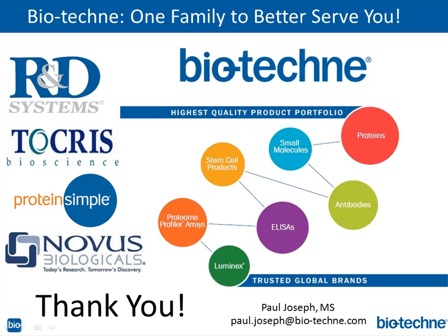Sure. Great. And then Yvonne comments, says, great presentation, and asks if you have any advice for phosphoproteins, and specifically, how can she keep phospho groups in the membrane?